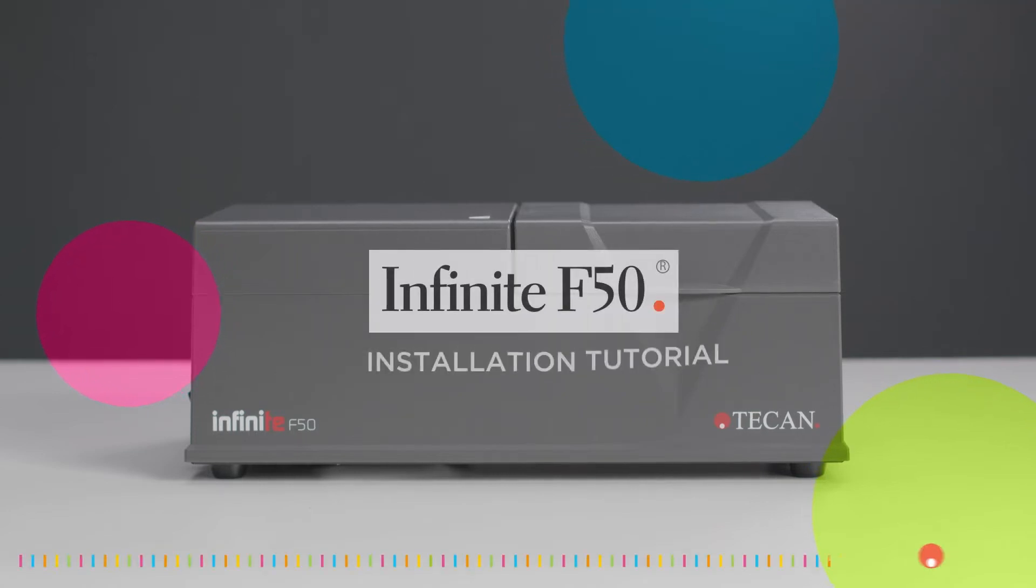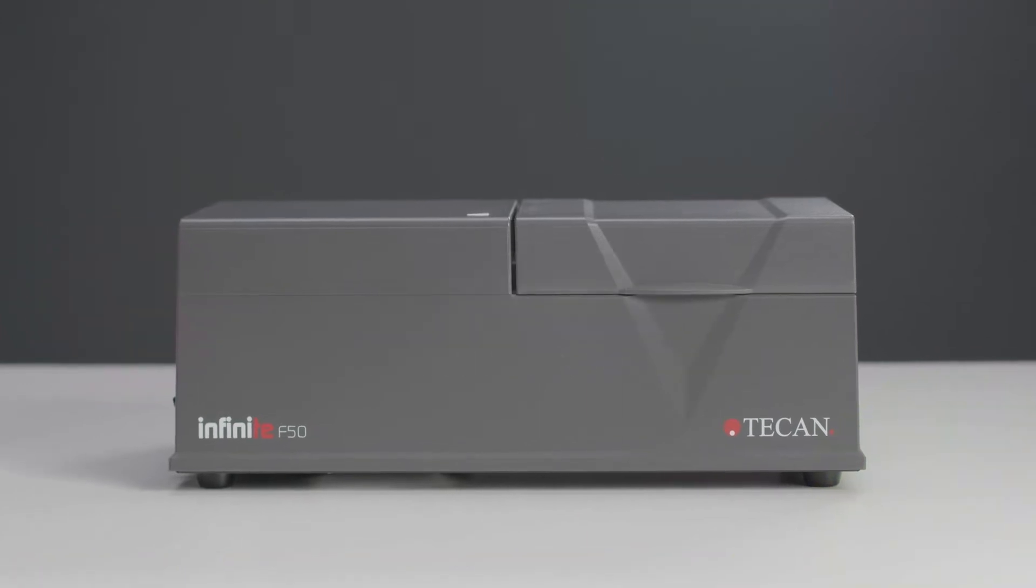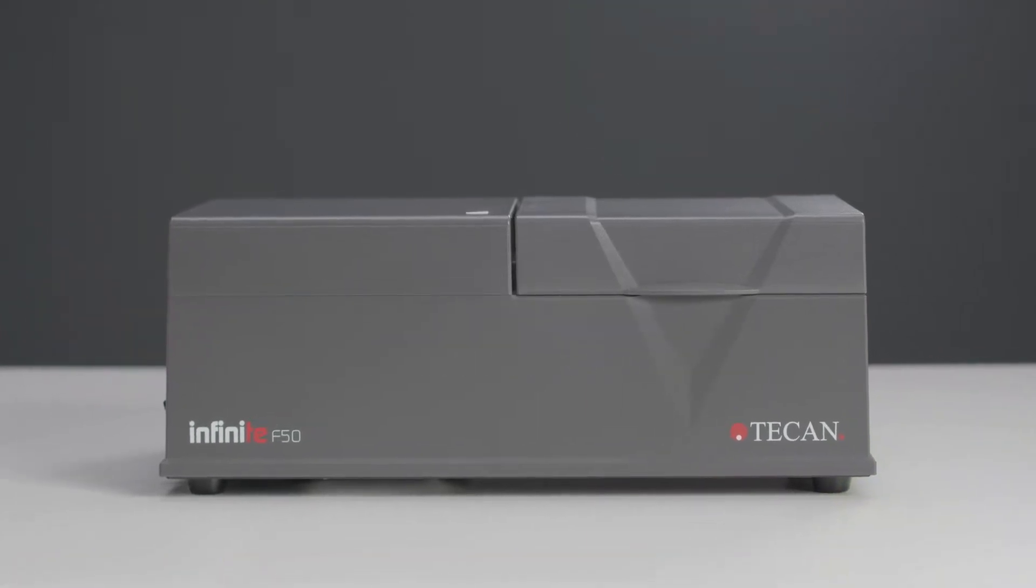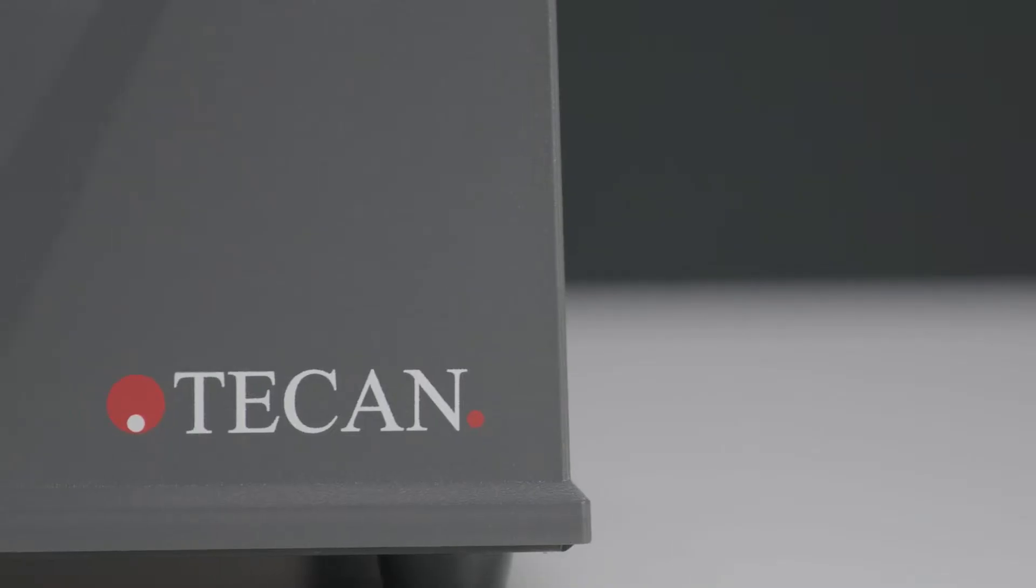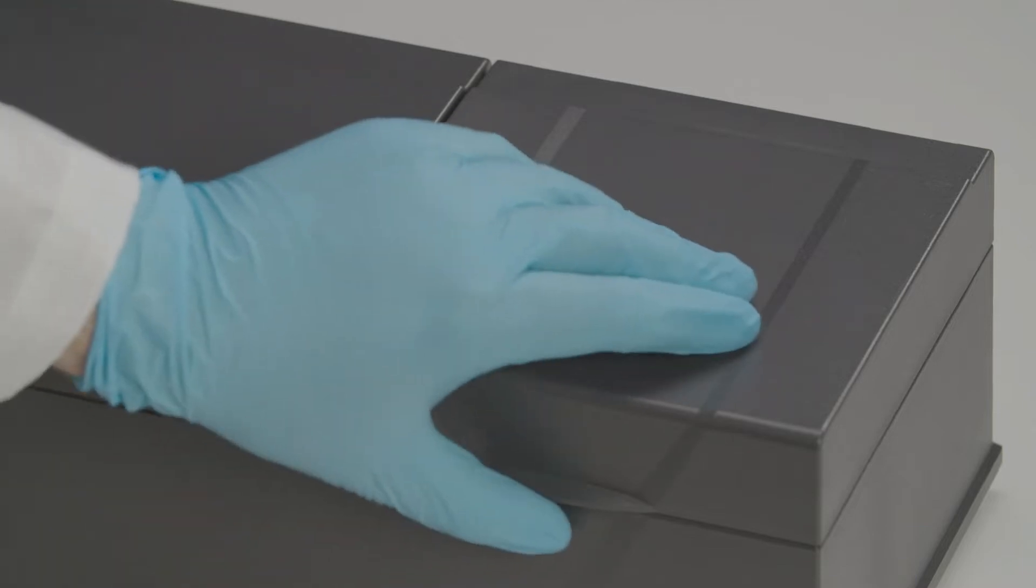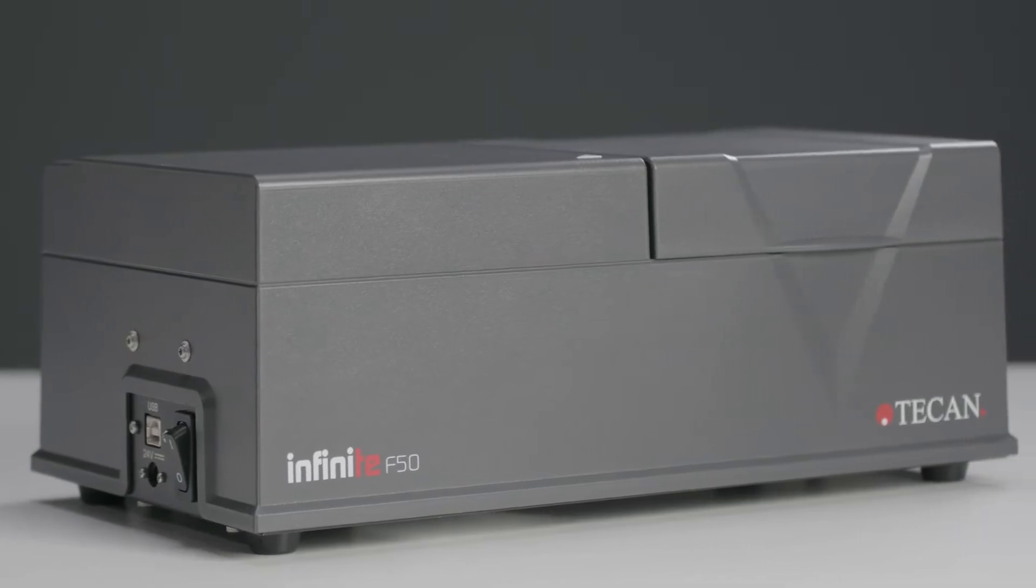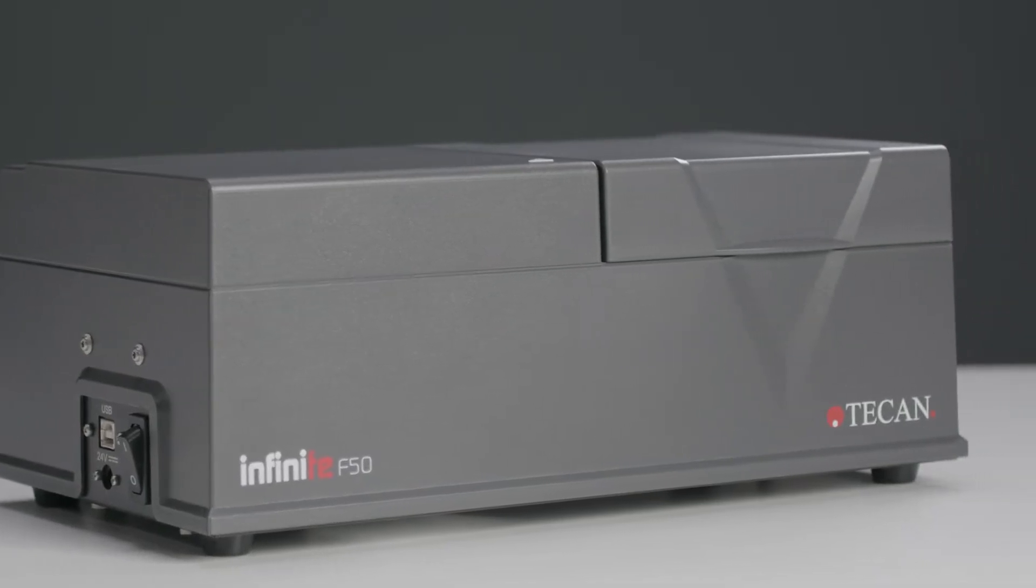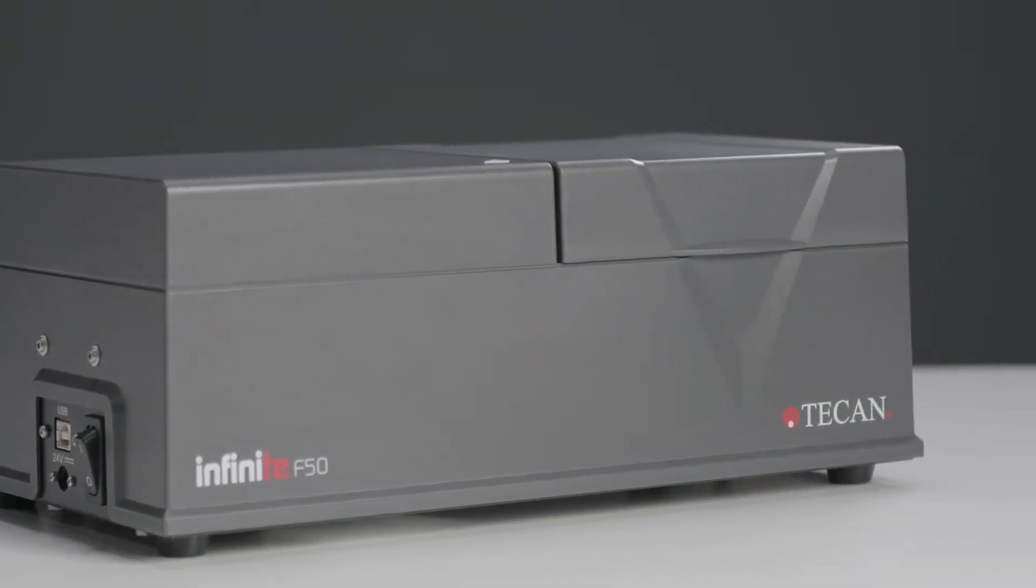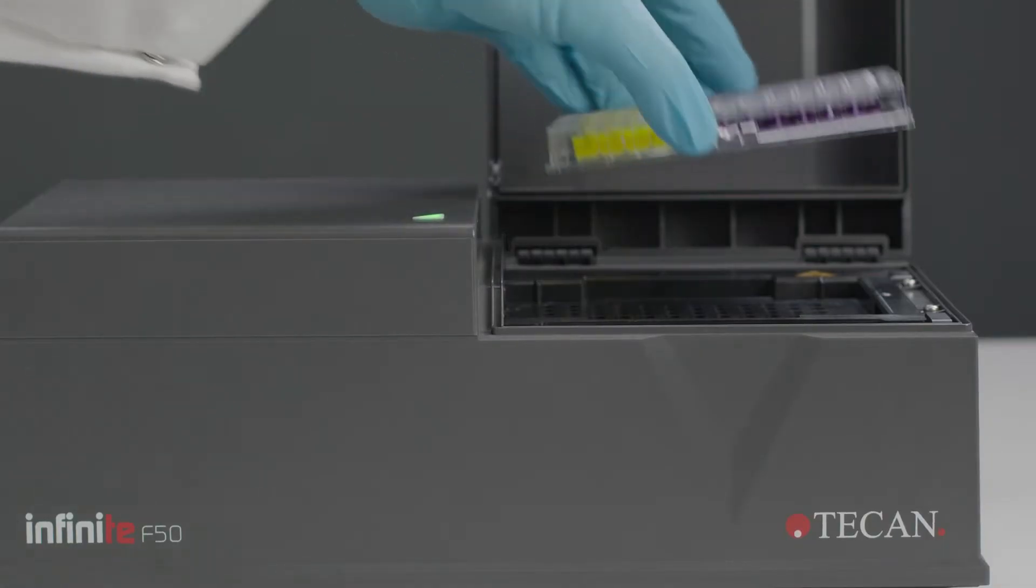Hi and welcome to the installation tutorial of your new Infinity F50 and the Magellan software. The 96-well plate absorbance reader is LED light source based and has a measurement range from 400 to 750 nanometers.